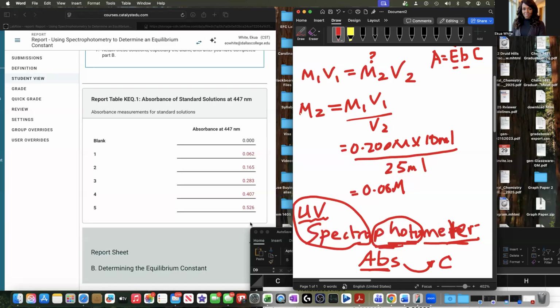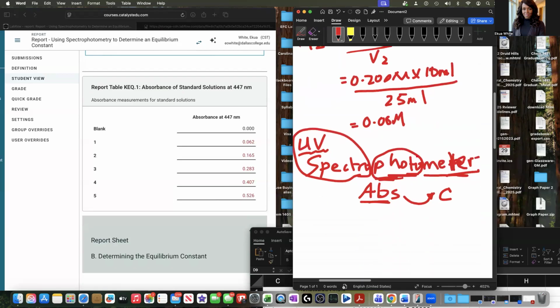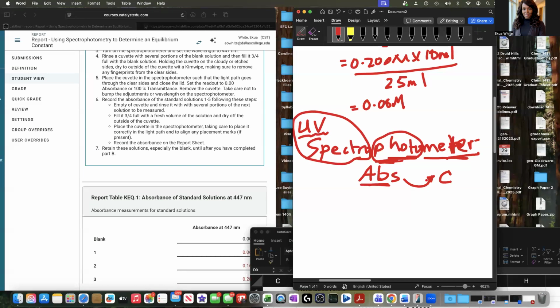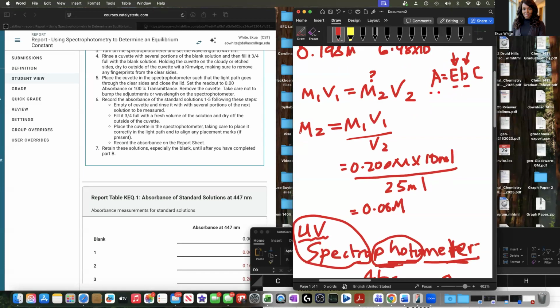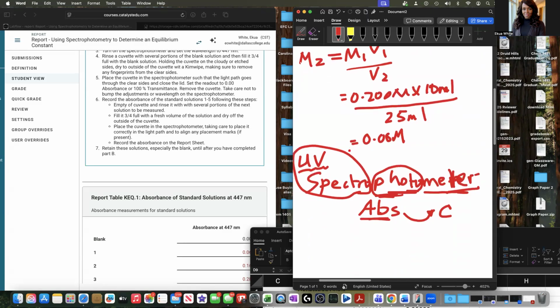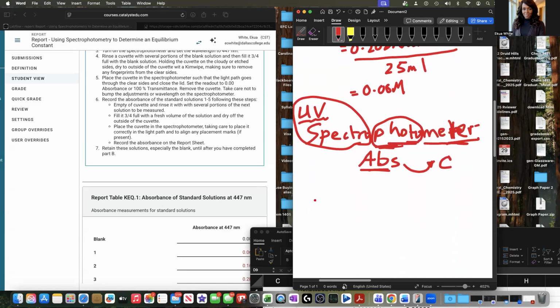So we're learning that process. Hopefully you're getting why we're here. Even though we know there's a direct relationship between the concentration and the absorbance, we want to know what these factors are in this lab. So what this lab will lead us to is something called the calibration curve. The calibration curve gives us the actual relationship for our experiment between our absorbances and concentration. The first half of the experiment is to get that innate relationship between these two, and they call that the calibration curve.